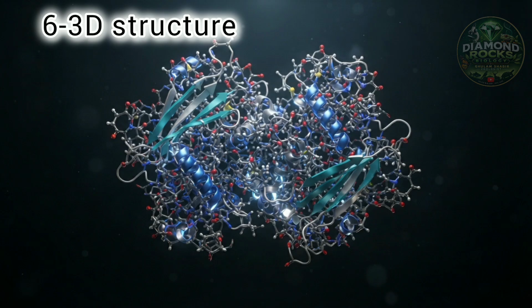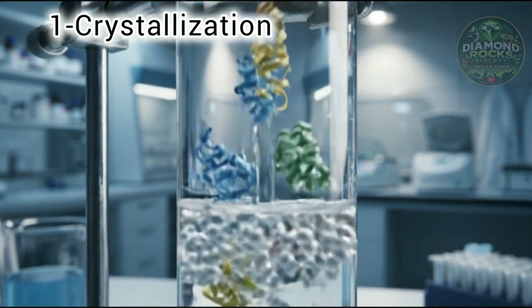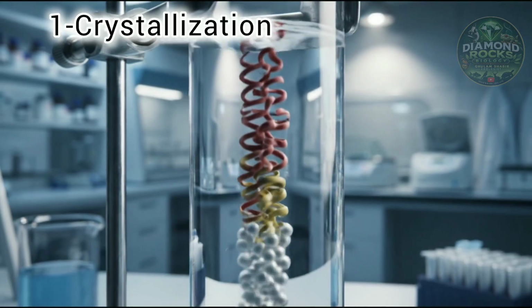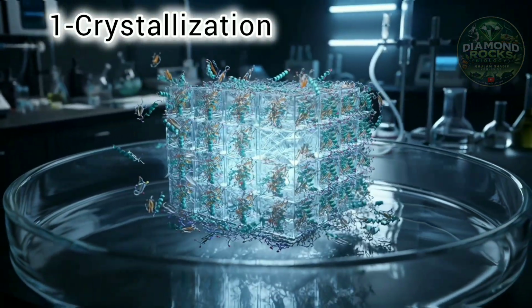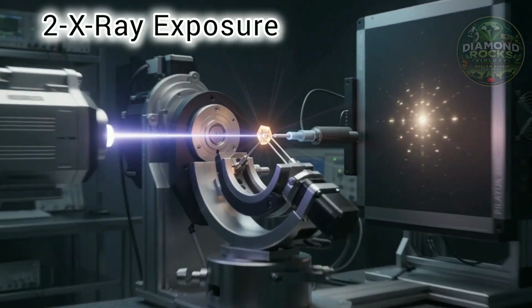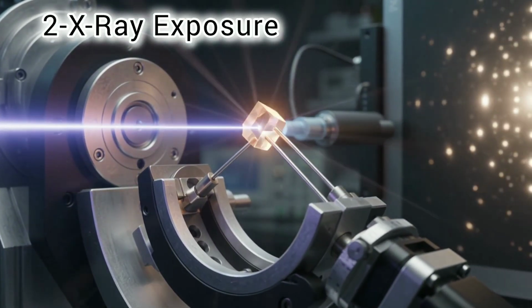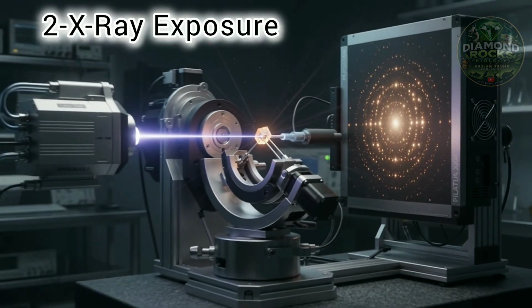3D structure. 1. Crystallization. The biological molecule, such as a protein, is purified and made into a crystal. In a crystal, molecules are arranged in a regular, repeating pattern. 2. X-rays are directed at the crystal. A narrow beam of X-rays is passed through the crystal.